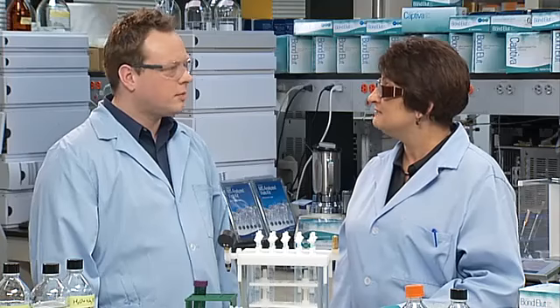In this segment, we will be reviewing the available SPE formats and discussing the 4 steps of SPE to help you maximize your solid phase extractions and get the results you need. Right, Ben? Right, Joni. And choosing the right format for your SPE is a great place to start. Choosing the appropriate SPE format will be based on the analyte, matrix, volume, and concentration of your sample.